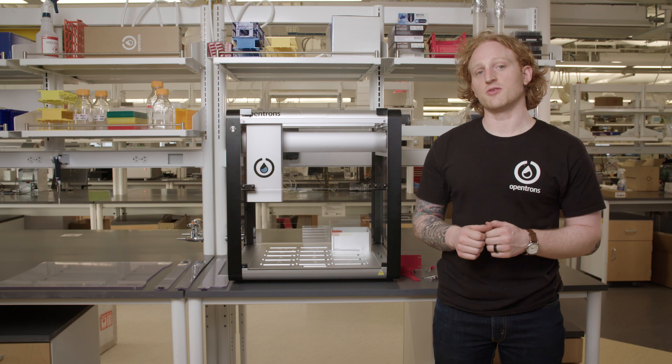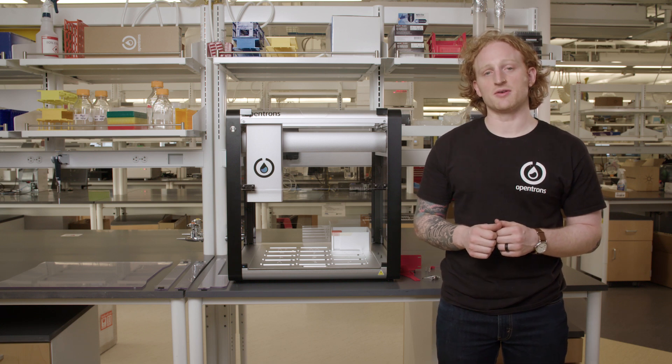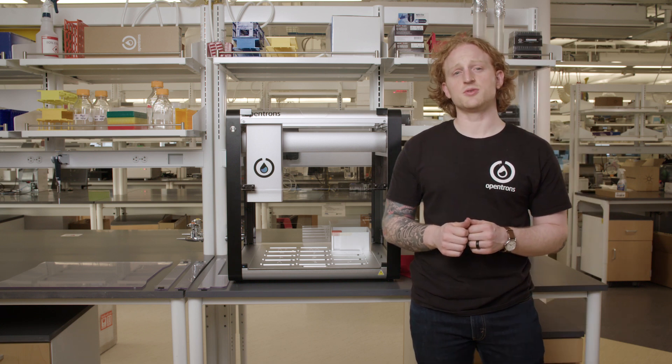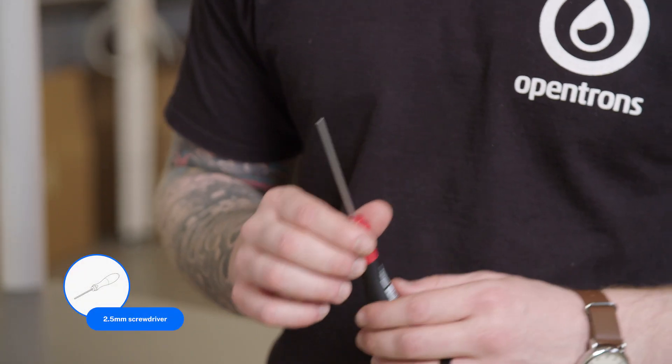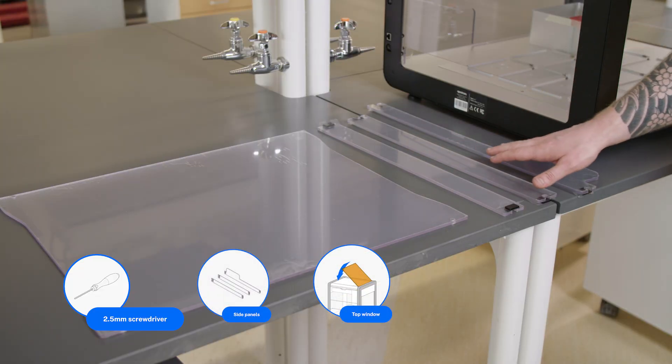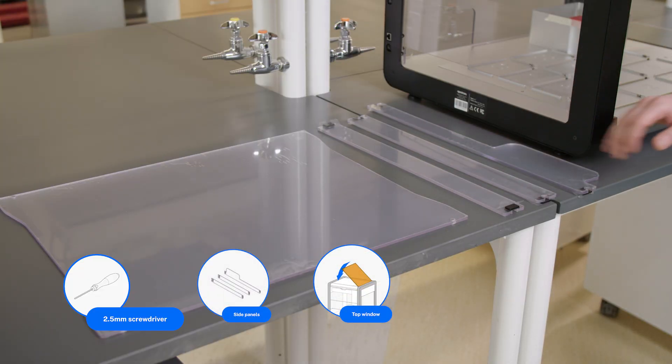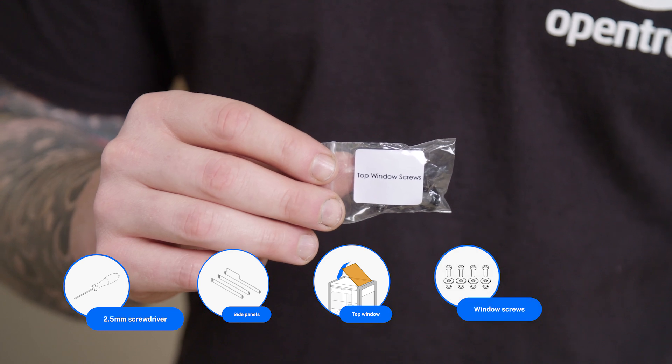To install the top window, I will need a 2.5 mm hex screwdriver, the windows that we set aside while unboxing the OT2, and the top window screws that were in the accessory box.